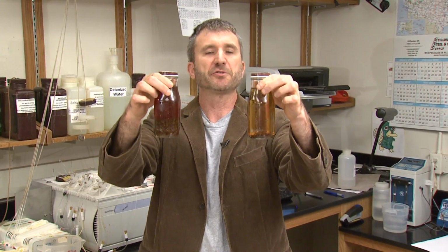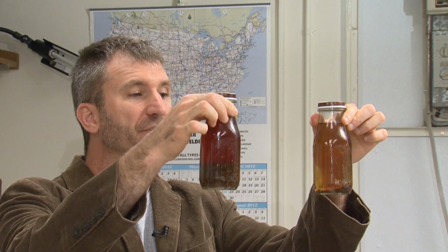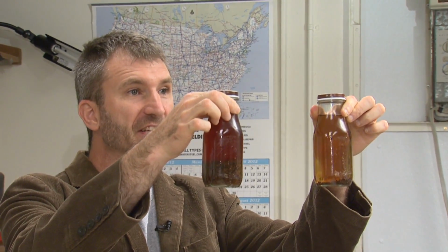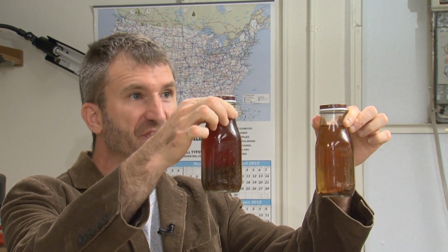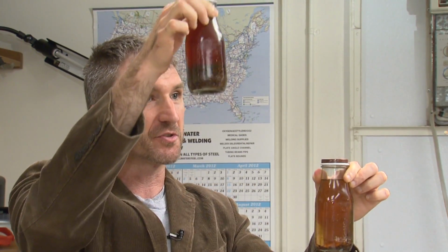Here are 2 bottles of tea. They both contain the same amount of water, but one was made with more tea leaves. And you can just look at this and tell which one has more tea. This is the weak tea, this is the strong tea. This had just a few tea leaves, this had a lot of tea leaves. And when you say this is darker and so it has more tea leaves, you're basically saying that there's light being emitted from somewhere.